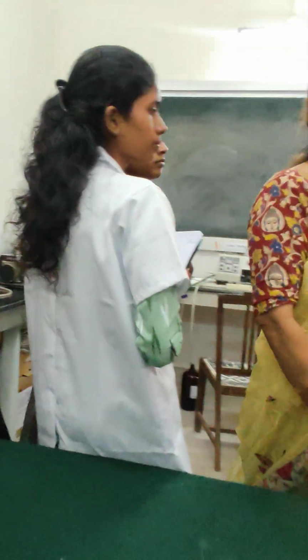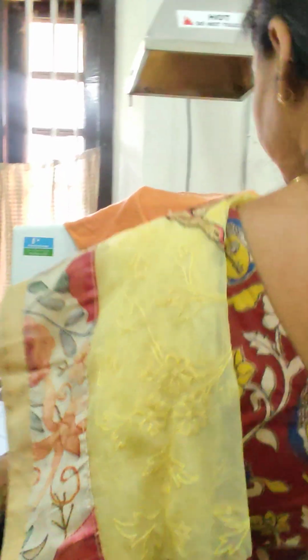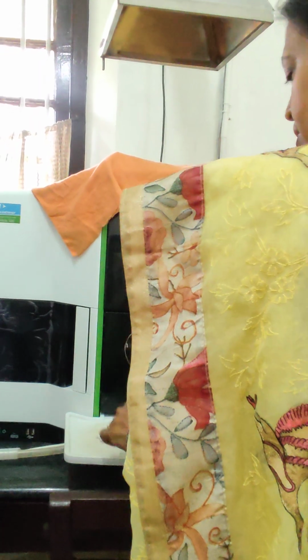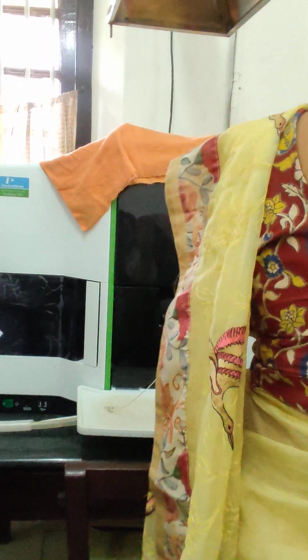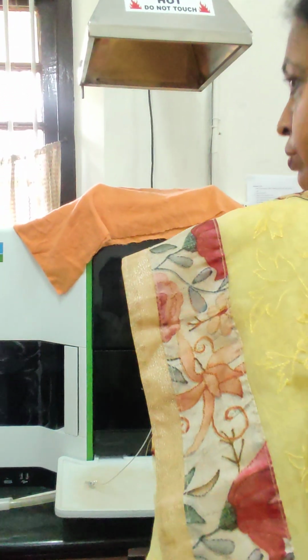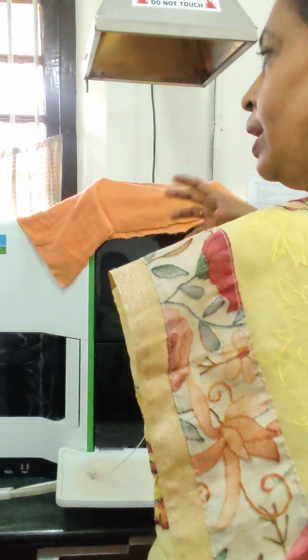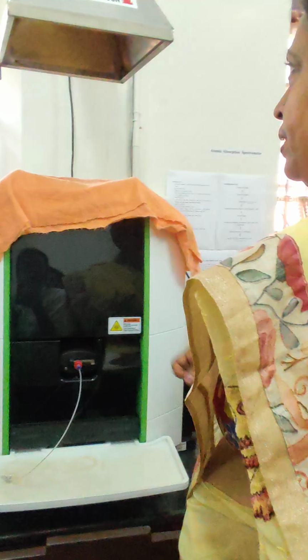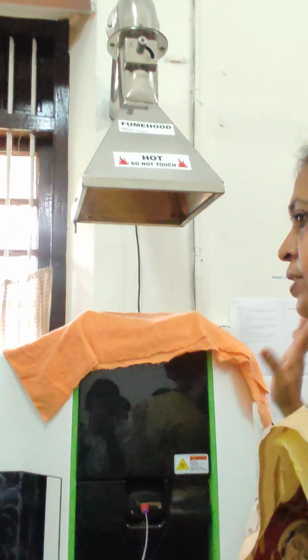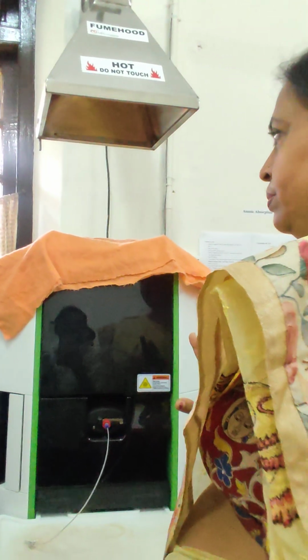This is atomic absorption spectroscopy. This equipment is 25 to 30 lakhs, very expensive, and it is also the same principle. It is a combination of a spectrophotometer and a flame photometer. Here we can introduce the sample in the sample holder and get the reading, and here burning of the sample will occur, and again the emission will be measured and displayed in the display meter. When you see such a fluid analysis, just imagine that it is an atomic absorption spectrophotometer. So the values and all, this is very expensive.